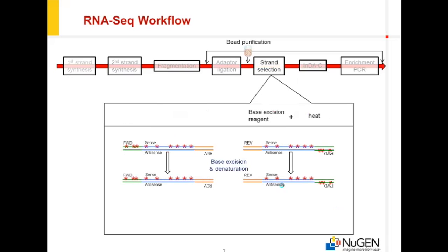such that when we carry out base excision, that is cleavage at this degradable nucleotide point, and final denaturation, we're left with only one form of the library that has both an intact forward and reverse adapter. This is then the only form of the library molecules that can be expanded during cluster formation and ultimately sequenced. So this is how we bring about a strand retention capability in the library construction workflow.